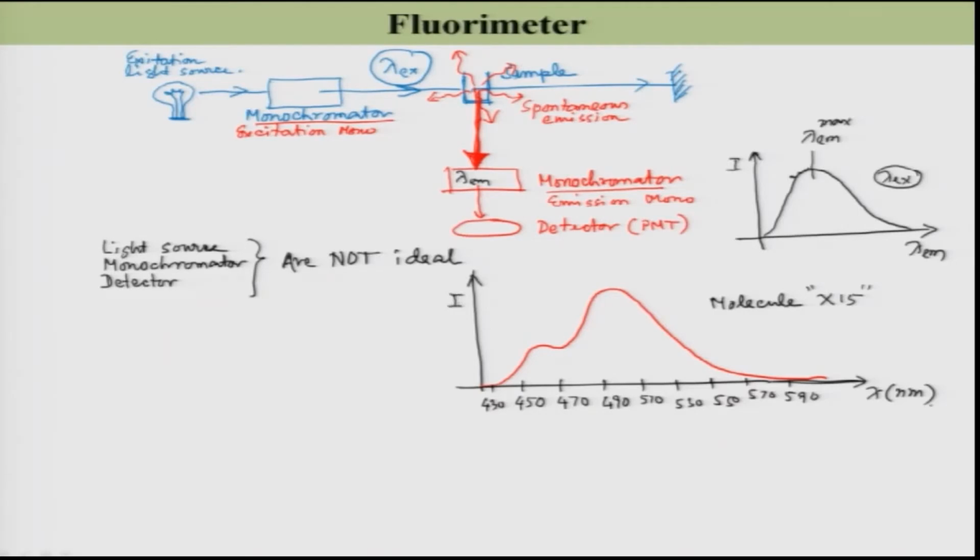So, this is the emission spectra, and imagine that this is the actual emission spectra of the system. So, you have taken this sample in your sample holder, and so your sample is over here, right, and you use a particular excitation wavelength of your choice, right. Let us say this excitation wavelength, and in that case it is also known that lambda excitation is equal to 400 nanometer.